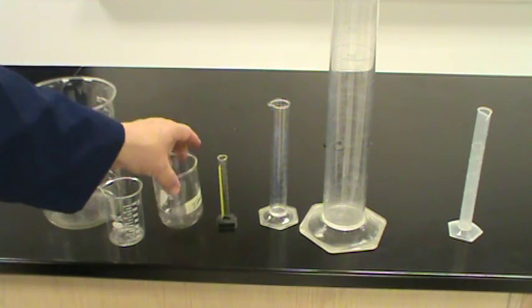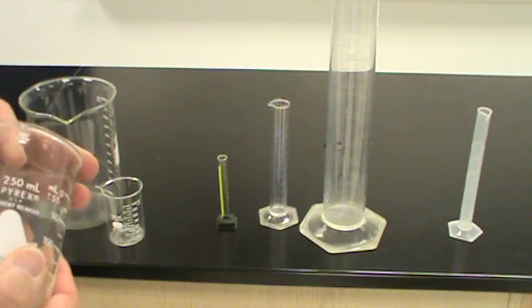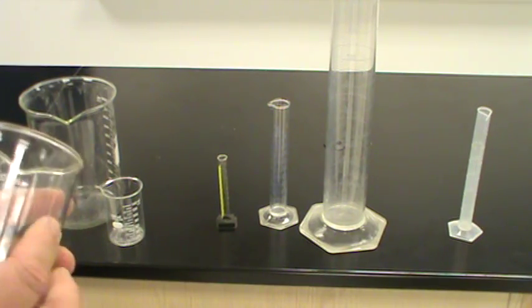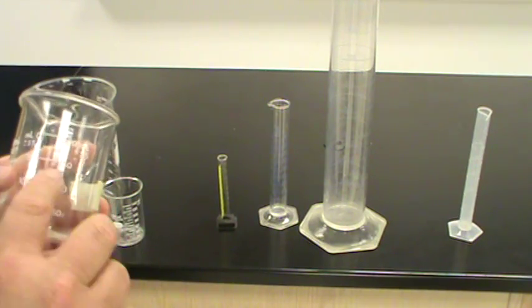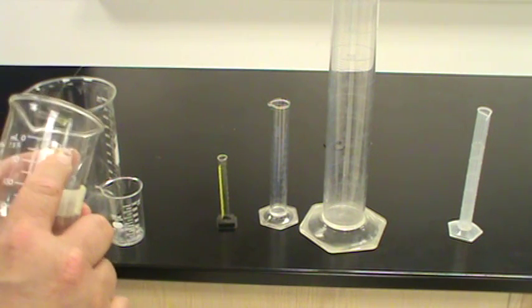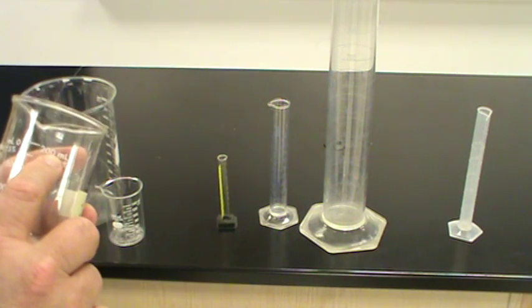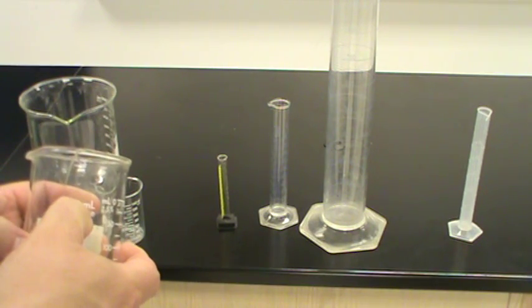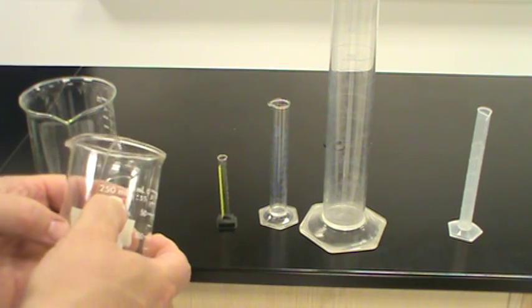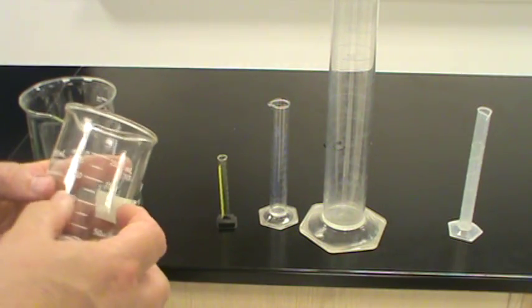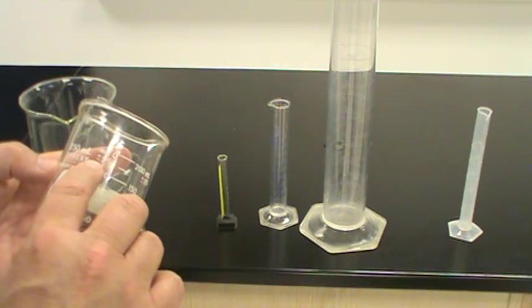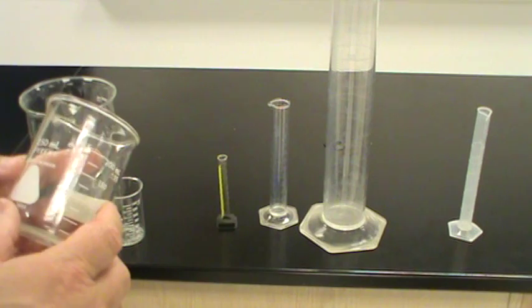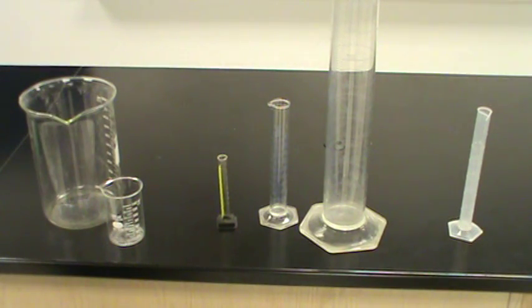In the case of the beaker, and this is a broken one as you can see right here, somebody dropped it and cracked it. What we can do is we can look at on the side what is the maximum amount that our beaker will hold. In this case, 200 milliliters. The capacity is actually 250 milliliters according to our beaker here and it says that it's plus or minus five percent. That's because it's at a given room temperature.